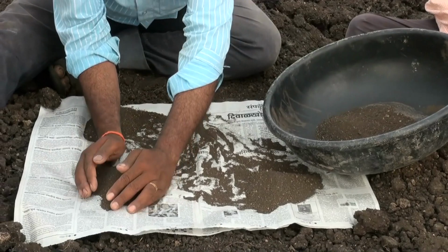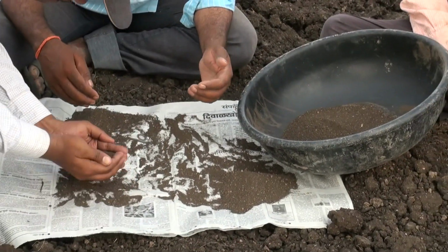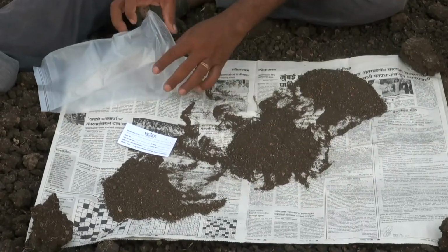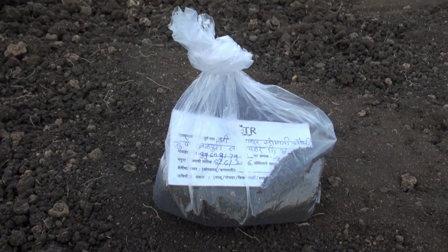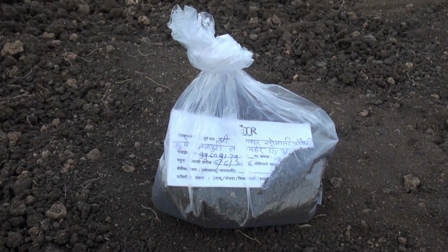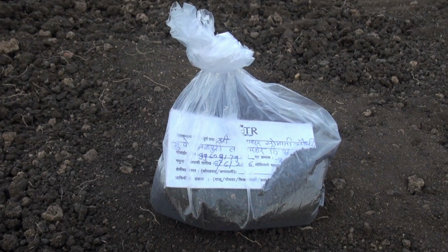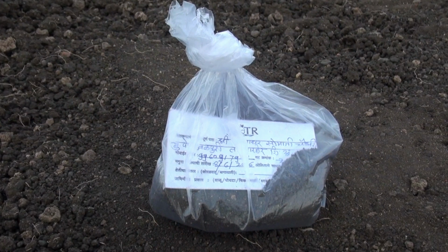From each compartment, a pinch of soil is collected. This process is repeated till the desired quantity of sample is obtained. Collect the sample in a clean cloth or a polythene bag. Label the bag with information like name of the farmer, location of the farm, survey number, previous crop grown, present crop, crop to be grown in the next season, date of collection, and name of the sampler.